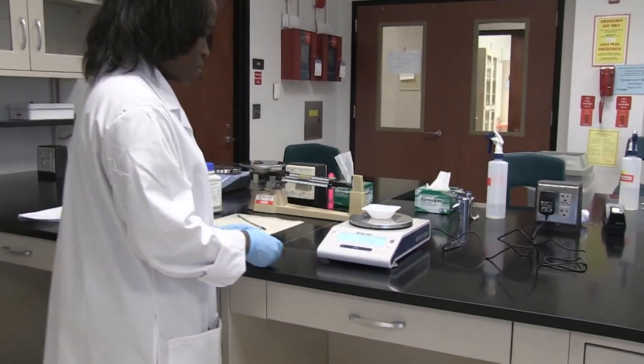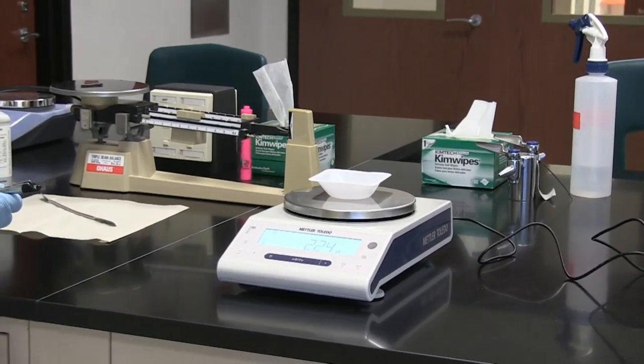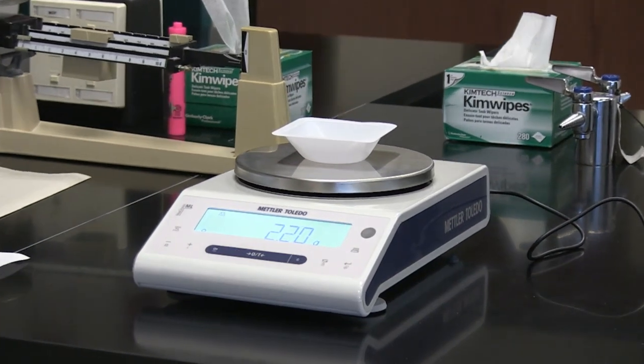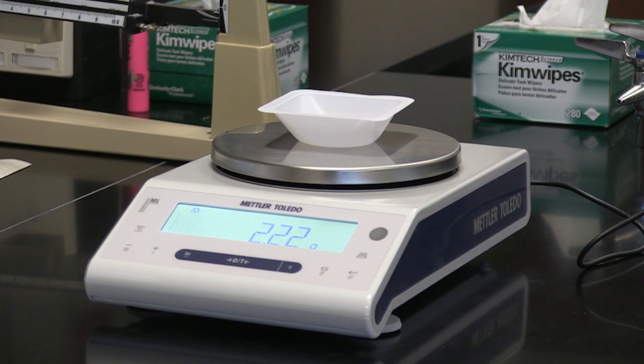Then I put my weigh boat on, and it's telling me that the mass of my weigh boat is 2.22 grams.